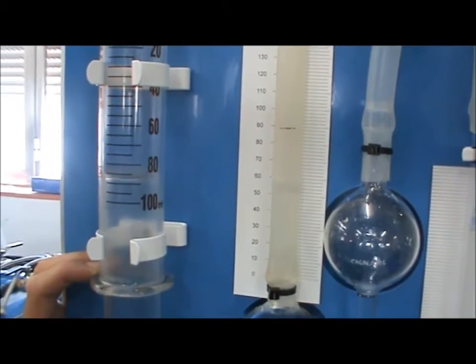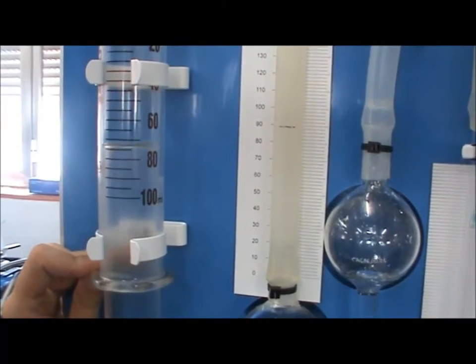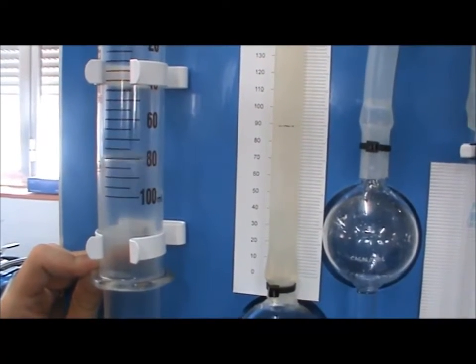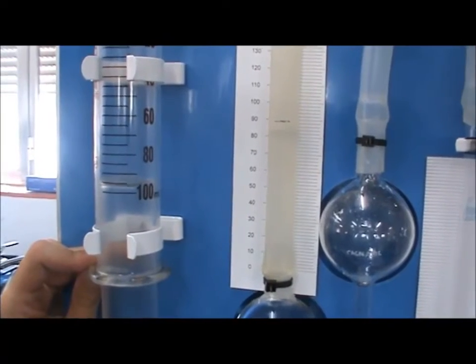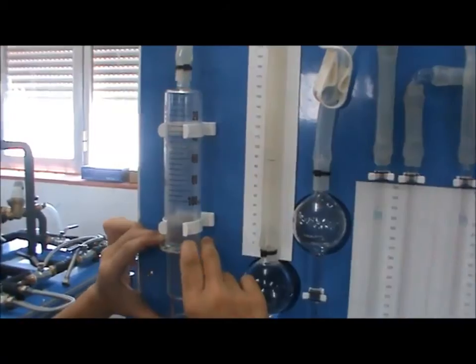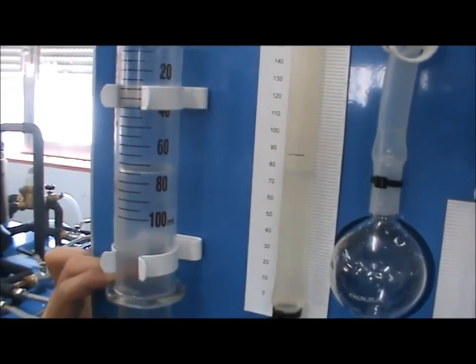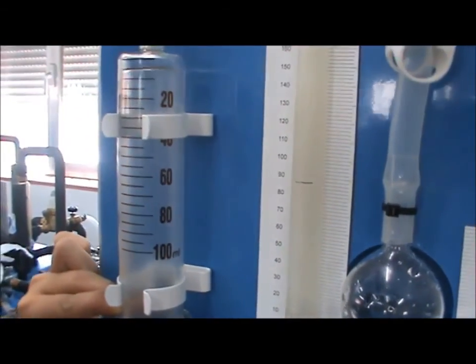Repeat these steps, gently pushing the sample into the vessel. Do not try to force the sample all at once. It takes time for the KOH to absorb the CO2, so be patient. Continue this process until you are able to easily compress the plunger, and the volume reduction in the syringe is constant. Now the absorption by the KOH solution is complete.